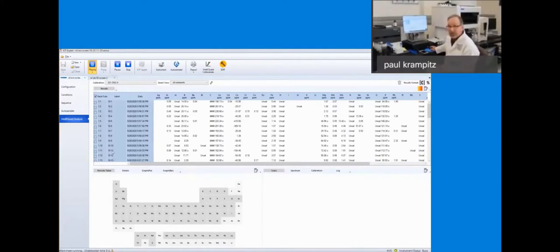So this is an intelligent screening method that we're running right now. And like I said, we're almost done with all 40 samples. But if you click on a particular sample, like number one, I forget what number one was. Number one was a Burlington Northern Santa Fe Railroad. It was a Cummins engine, and the oil brand was a 15W40. So that's what that particular sample is that we're seeing here right now.